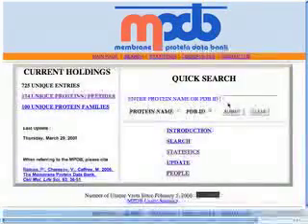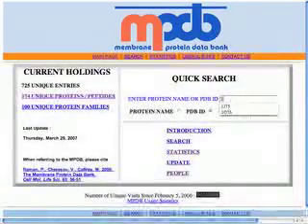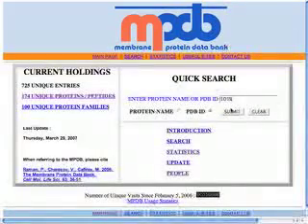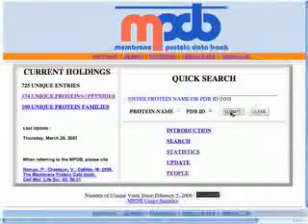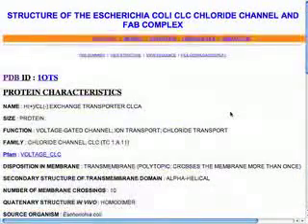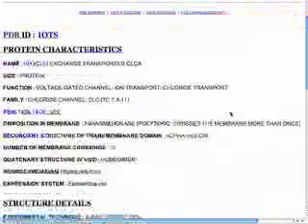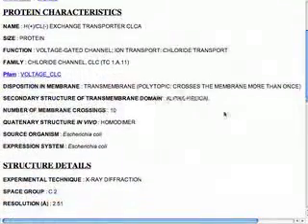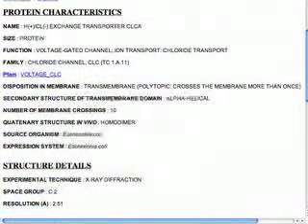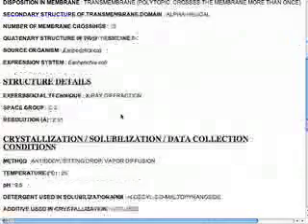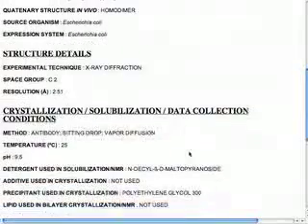For example, if you want to directly look up any of the details for any particular membrane protein, you can just hit it there and hit submit. Just like the PDB almost, you can get details of the source organism, expression system, and importantly, things that are directly involved in crystallization, solubilization, and data collection.